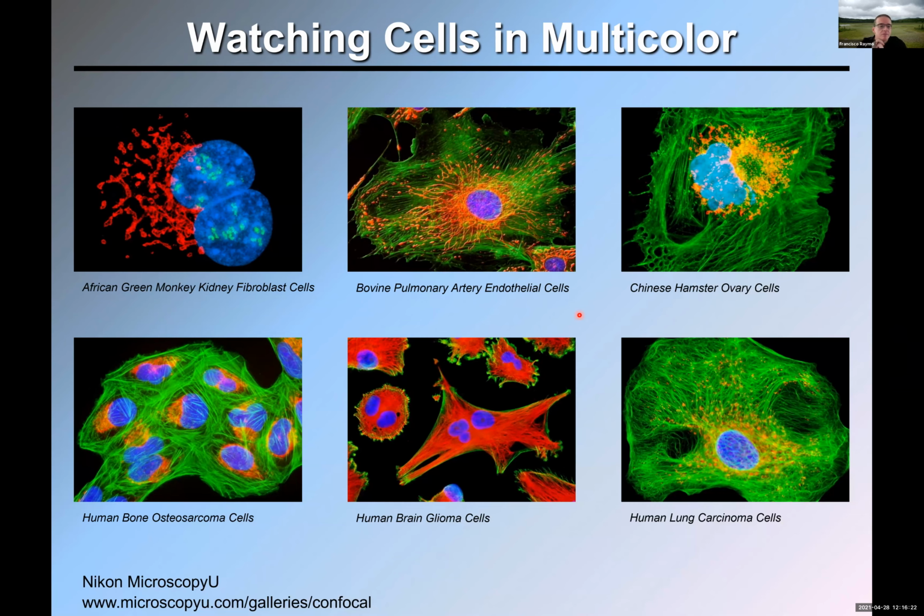Now, one limitation of this technique is that the resolution of these images is limited to the micrometer level. And of course, molecules are much smaller than that. So it is not possible using conventional fluorescence imaging to investigate structural features at the molecular level. And this is because of the phenomenon of diffraction.